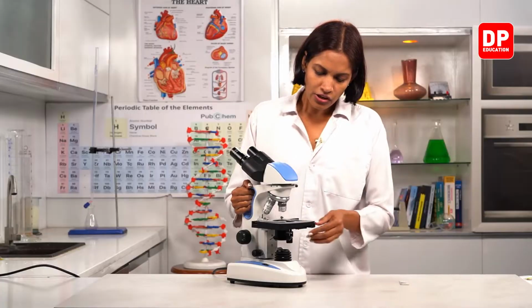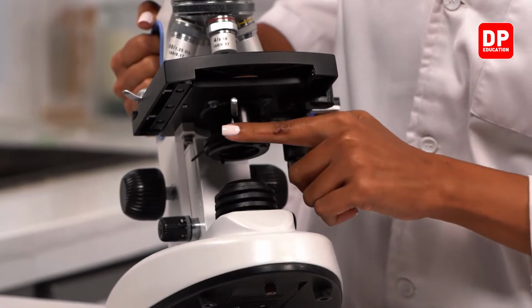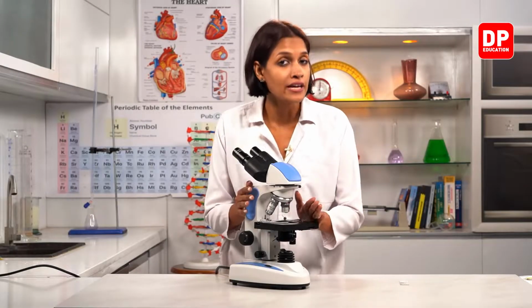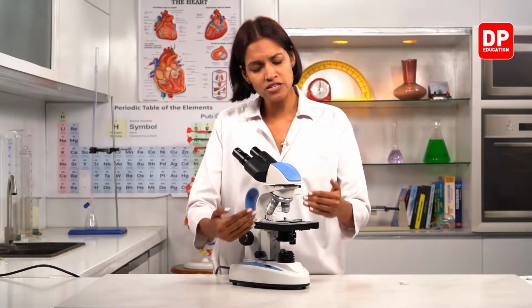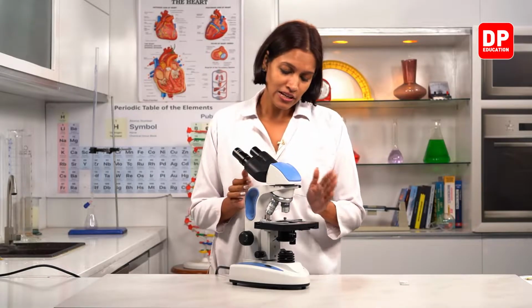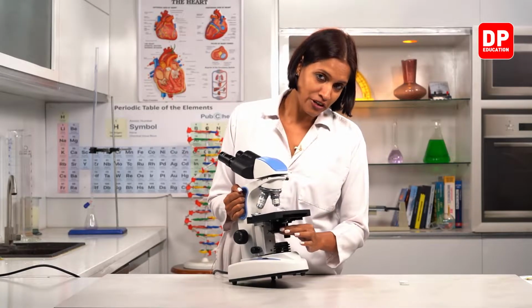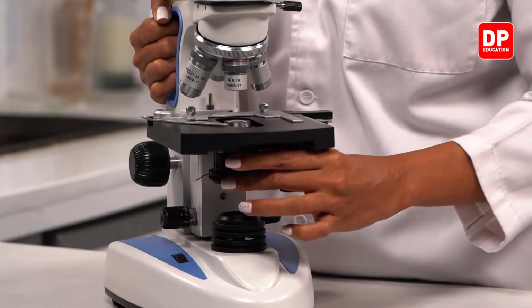Now, can you all see under the stage, there's this circular part, children? This is known as the diaphragm. Now, you all know we call this compound light microscope. What is the reason? Why light microscope? Because it uses a beam of light in order to observe the object, right? So light is coming from here, but at times we need to control the amount of light that comes towards the specimen. So that is done by this diaphragm. Okay, children, by rotating this diaphragm, we can adjust the amount of light that comes.